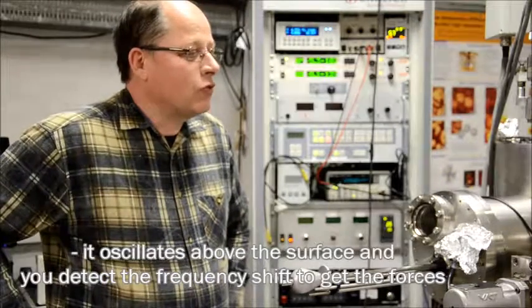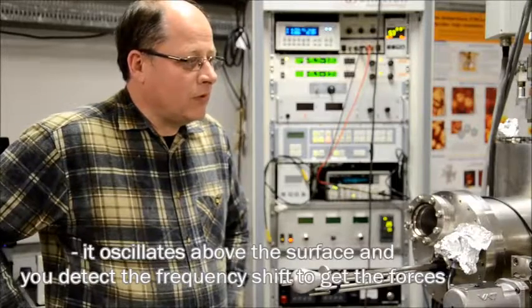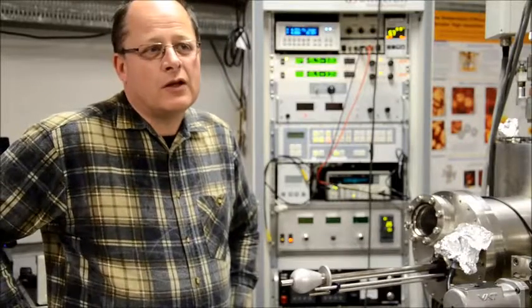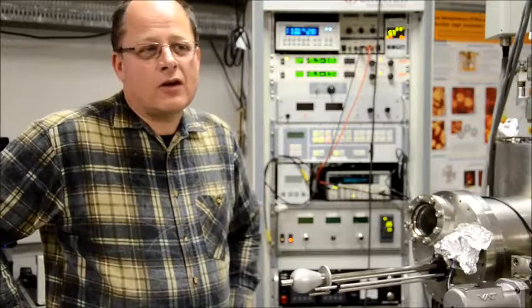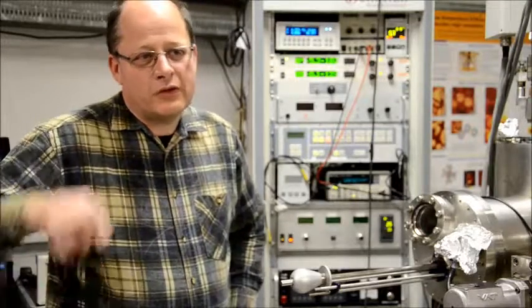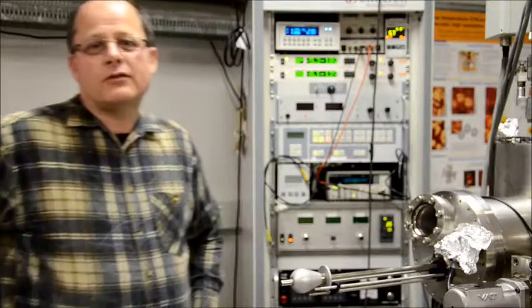So you can go down to submolecular resolution. So you can see the rings of carbon, for example, of C60 or of these nanoribbons. So that's what you can do.